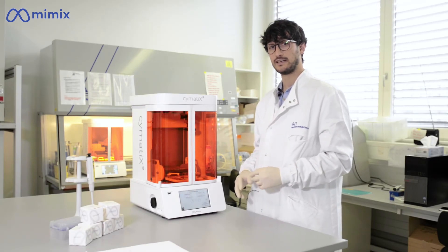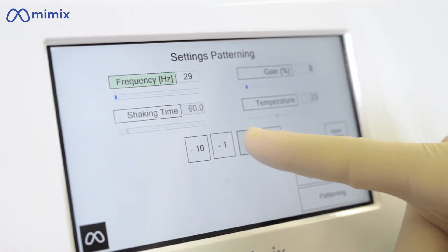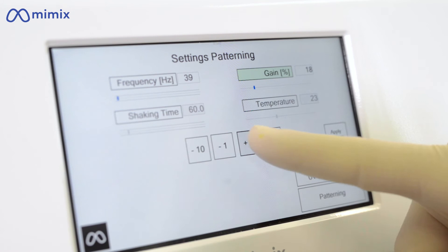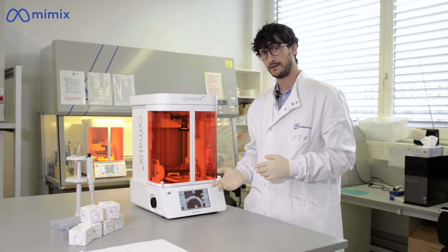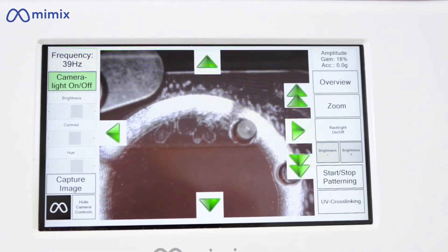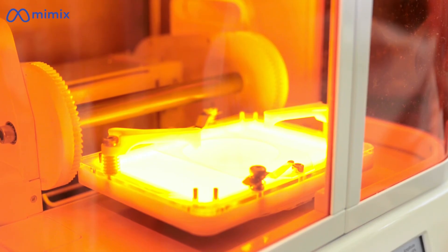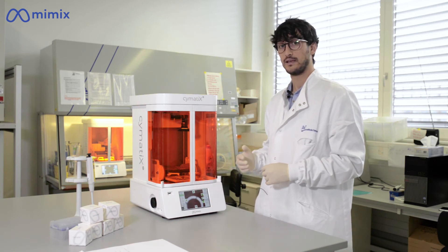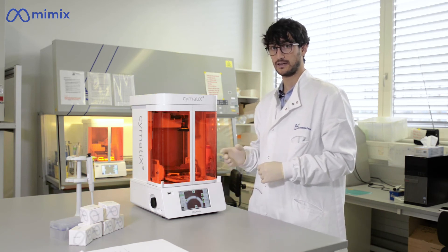As a next step, you will need to set the patterning parameters, and through the interface you can easily set your initial values of amplitude and frequency of the vibration plate. When you enter the patterning interface, the camera view will appear on screen and you can select either an overview position or a zoom position to have a closer field of view on your sample. At this point, you can also decide to start or stop your backlight illumination and control the camera settings through the left panel of the interface, including starting or stopping the light coming from the camera directly.